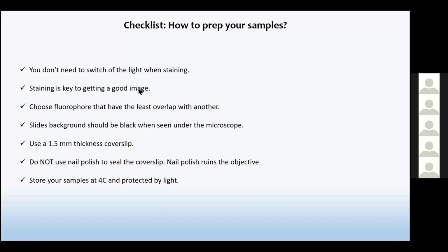One of the things to remember is to make sure that your slides have a black background, because if you are not seeing a black background, chances are you have a lot of unwanted background staining, which you want to clear off by using either TBST or PBST. It is a myth that you can only use PBST. You can also use TBST. There's no limitation. The only difference between the buffers is the salt, and it's pretty much the same thing.